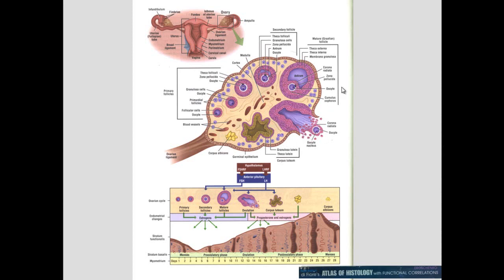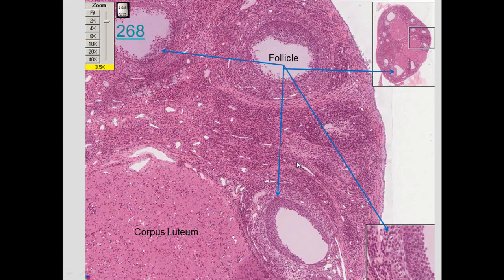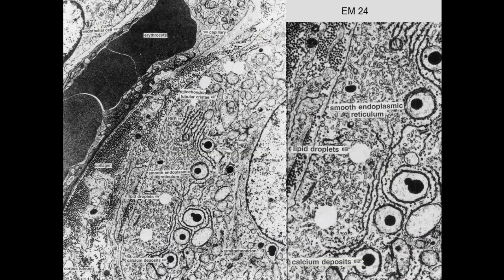Ovary is another source of endocrine hormones being produced. You have FSH and LH coming down from the pituitary, and that stimulates the ovaries to produce estrogen and progesterone to maintain pregnancy. Pregnancy has occurred, and here we see the follicles. So these are follicles where the eggs would be, and then after the egg is ovulated, it makes a corpus luteum. Luteinizing hormone causes ovulation to occur, and then luteinizes these cells that are lining the egg, the follicle, and that produces the corpus luteum.